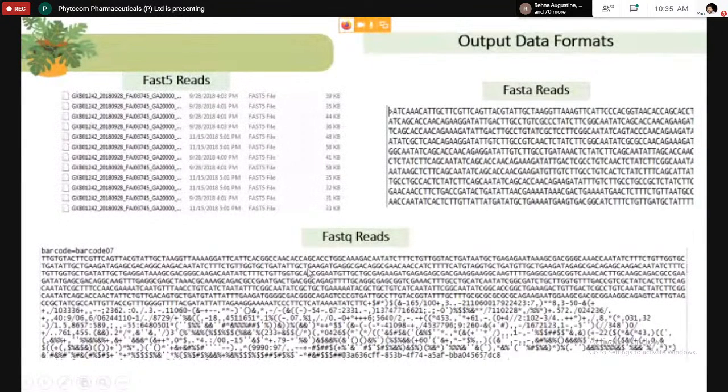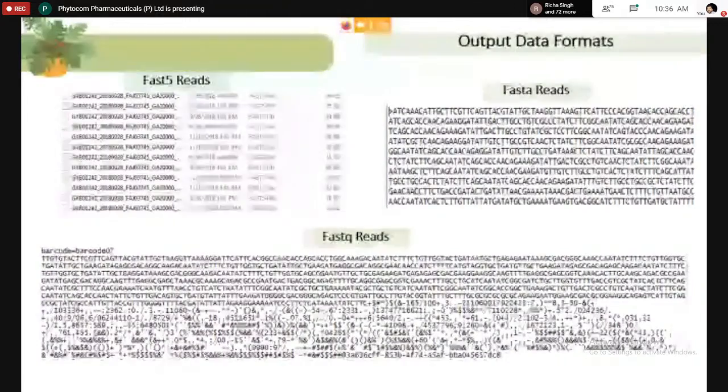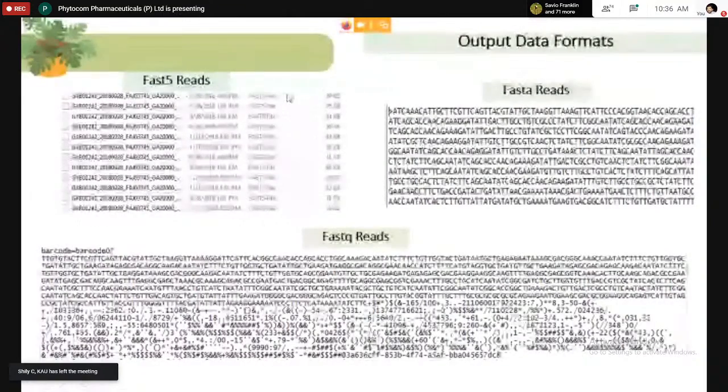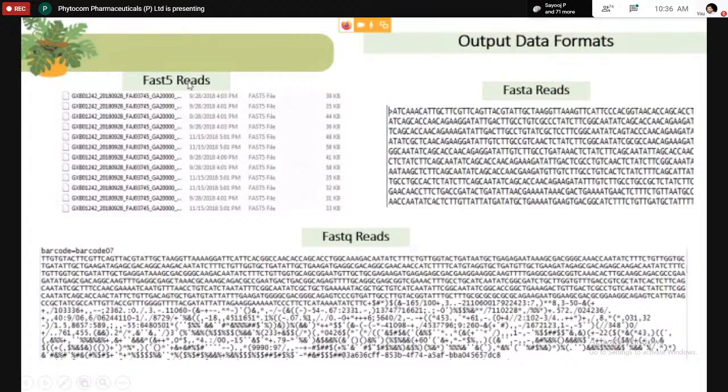If you want to convert FASTQ reads to FASTA reads, you have to specify that the sequence was generated from a nanopore. If anything is missing in the script, it won't convert and will show an error. These are all raw data, and this FAST5 file is what we use for base calling.